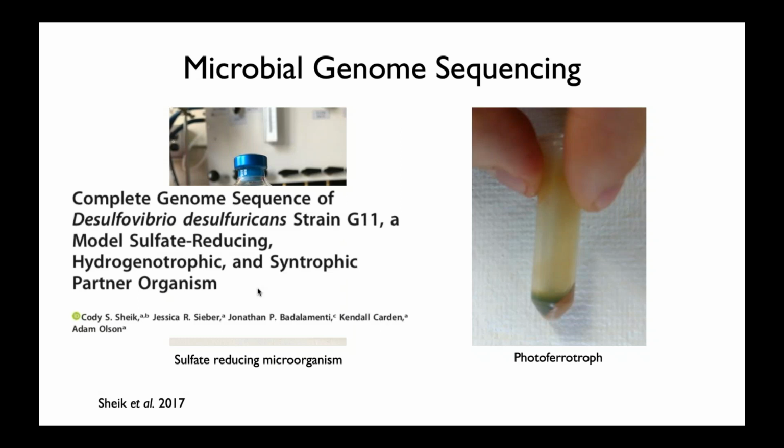And so we were actually able to sequence this genome into a unitig, so one contig. We gap closed it. There were several indels, but I felt like that was pretty good for what we wanted to do with it and just use it as a lab reference. And so we published this in Genome Announcements in 2017.